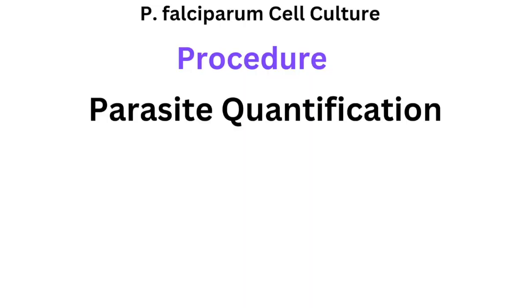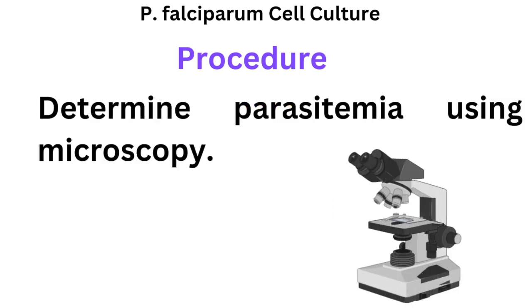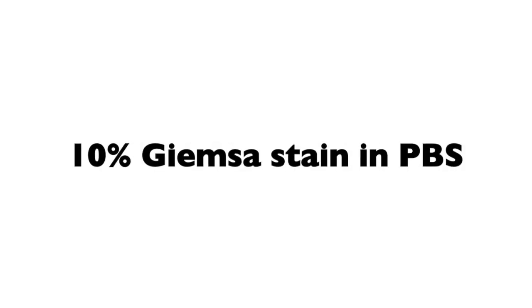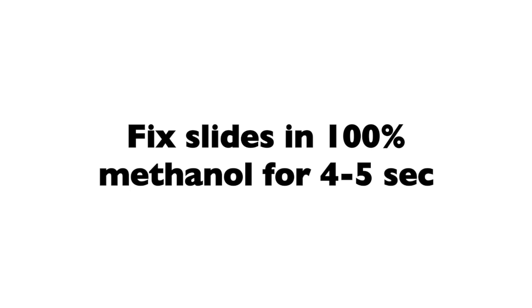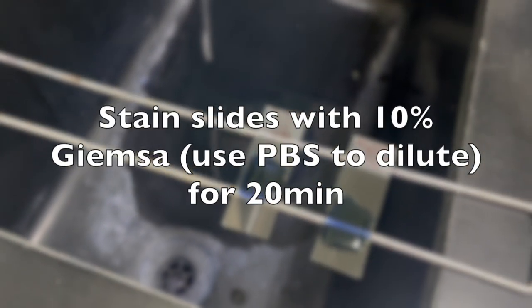We need to quantify the parasites inside the red blood cells to see how the parasites are doing. To quantify, you'll need a microscope, methanol, and Giemsa stain at 10% — made from a 100% stock and dissolved in phosphate buffered saline.